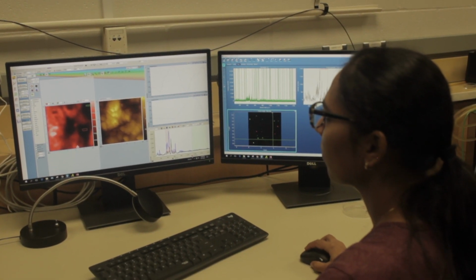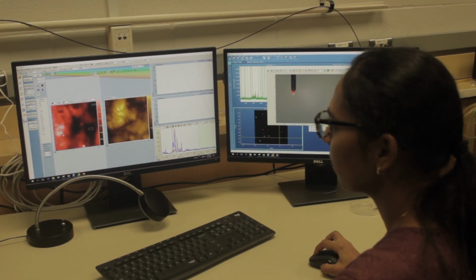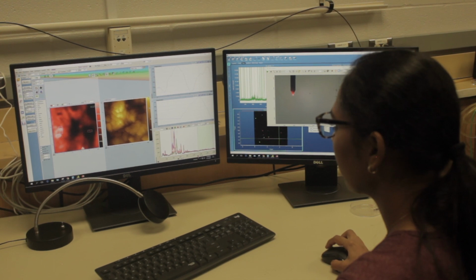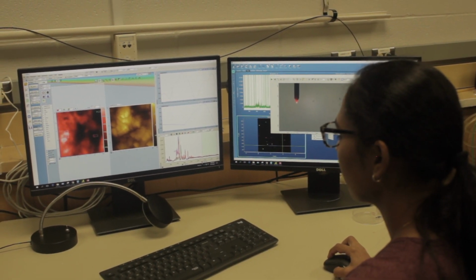The apex of the tip generates a highly amplified field, which when positioned above a molecule enhances the Raman signal at the nanoscale, and simultaneously we can record the surface topography of the nanomaterial. TERS introduces a new dimension to SERS by enabling two-dimensional chemical imaging with nanometer optical resolution.